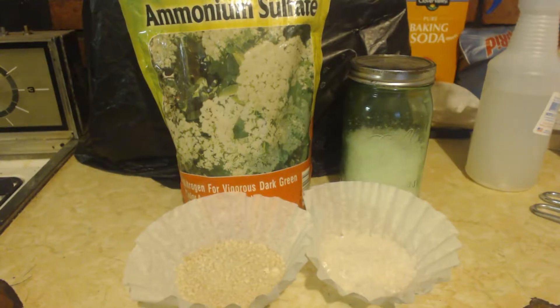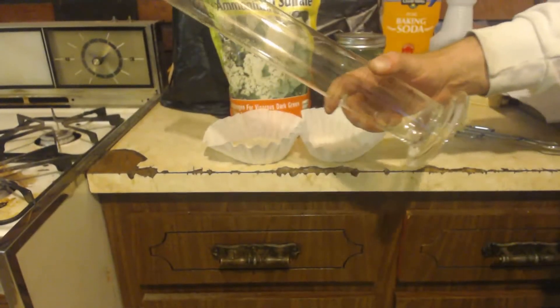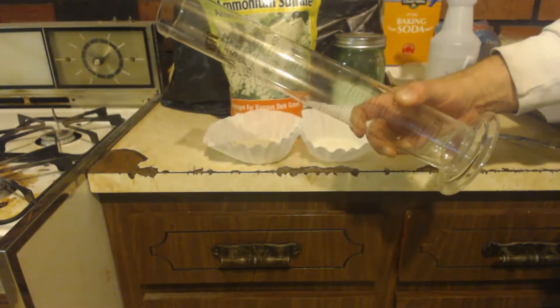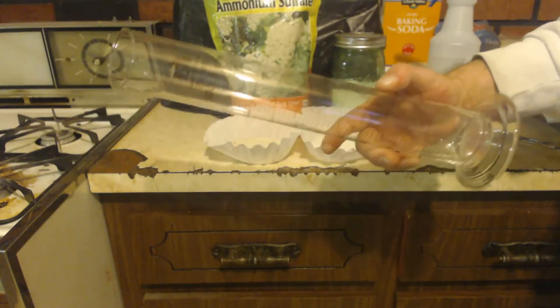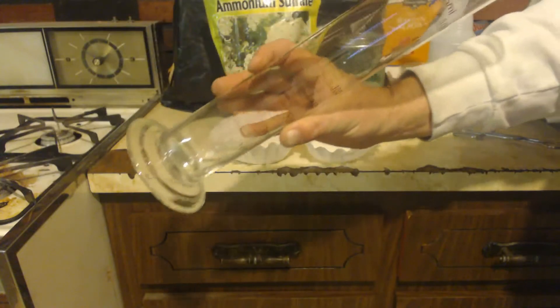One more thing — look what I found. I found a 500 milliliter graduated cylinder. So now I have the complete set, from 10 milliliters up to one liter.